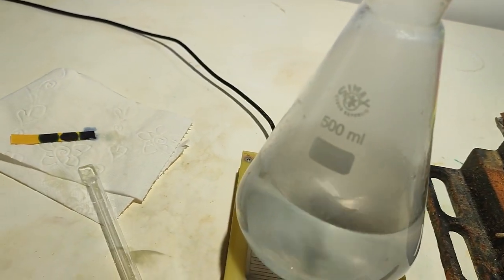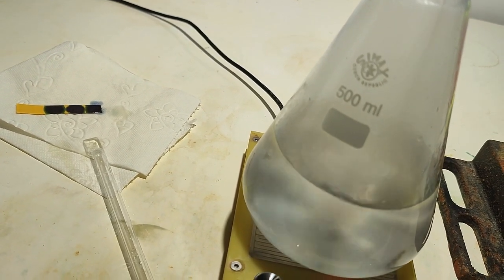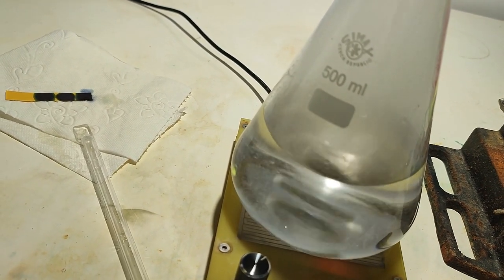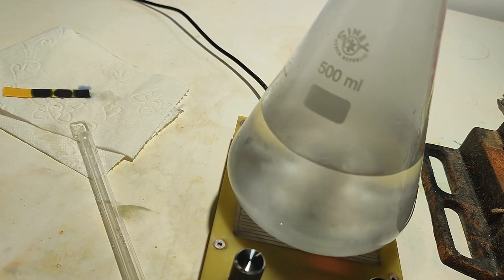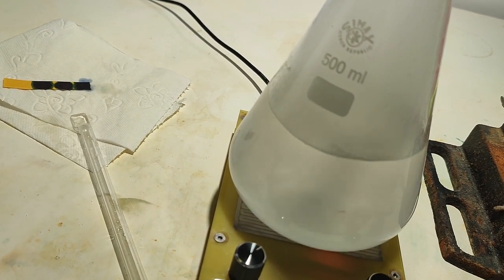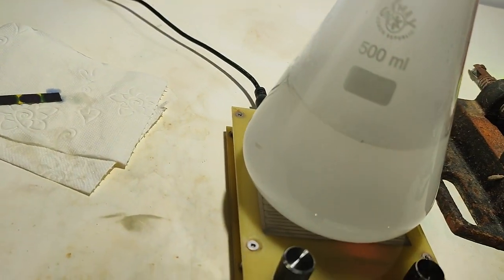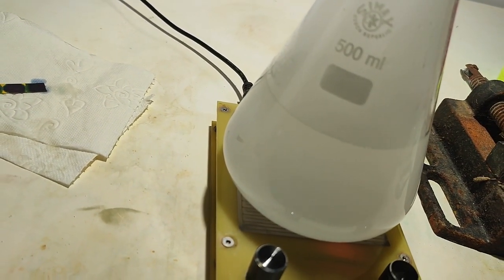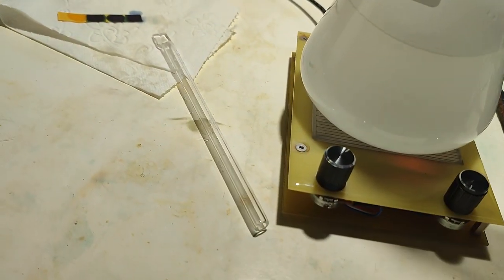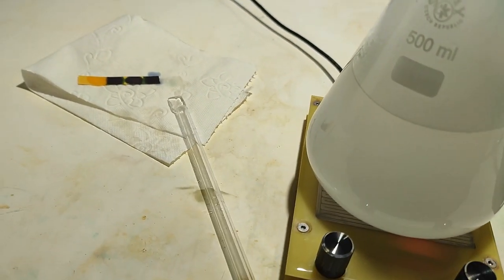So when the pH gets to acidic level, the methacrylate should pop up from the solution. You can see that the color has changed quite drastically and there is some white stuff while I add the hydrochloric acid, and that's what we want, and we want probably quite acidic solution. Okay, now it's neutral. Now it's probably quite acidic.